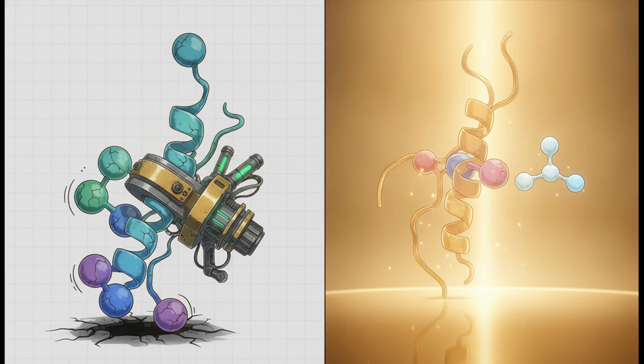But tagging a protein is kind of like forcing a dancer to wear a heavy winter coat. It changes their shape and alters how they behave. SPR, on the other hand, allows us to watch these interactions happen in real time, completely in their native state, without any of those costly or disruptive labeling reactions. We're observing nature exactly as it is.